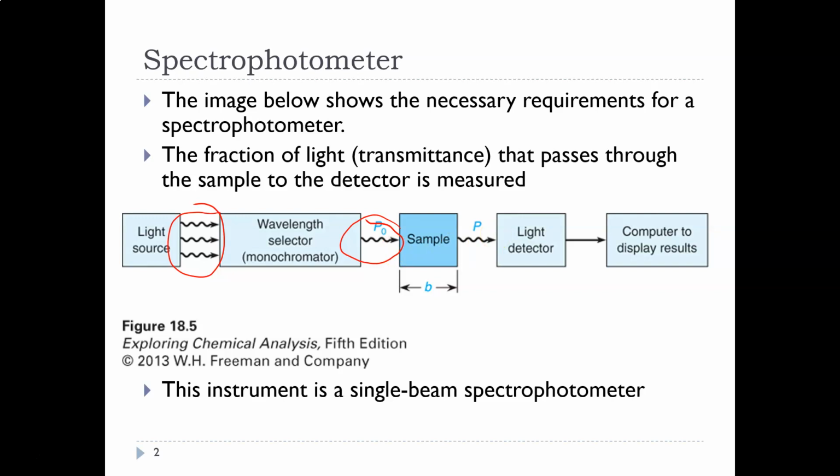We will look at a double beam spectrophotometer here soon, and it will be important that you know the differences between a single and double beam spectrophotometer and be able to draw this diagram for both of them.